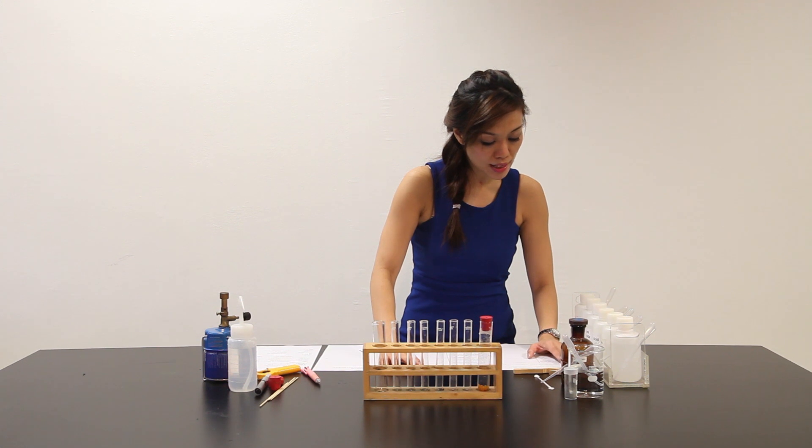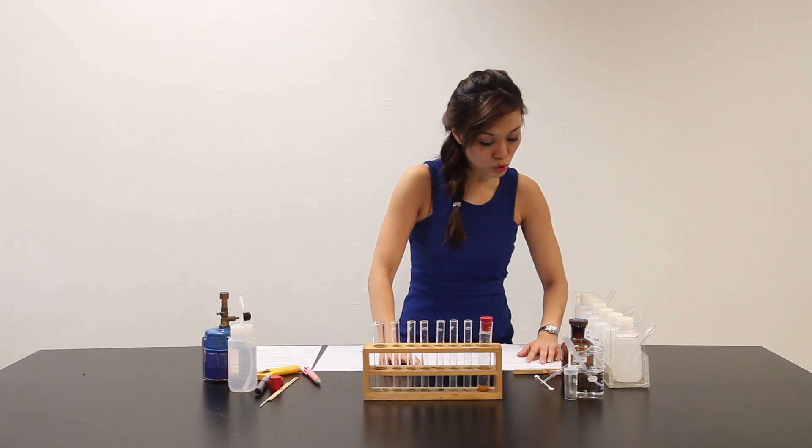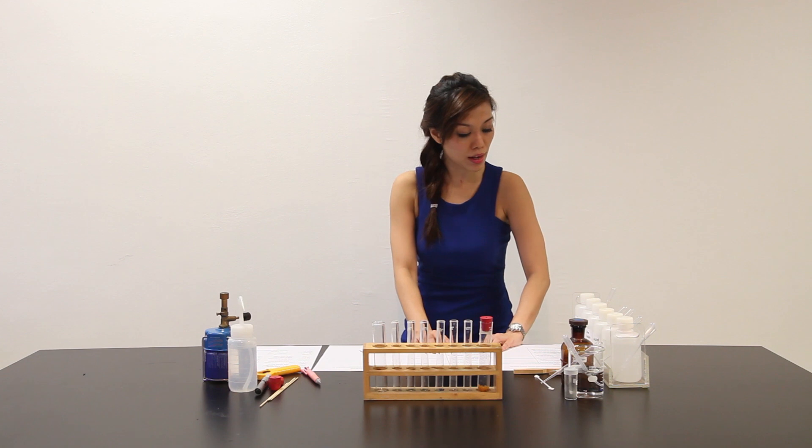Carry out a boiling experiment and test any gas evolved. Carefully record your observations. The volumes given below unless referring to drops of solution are approximate and should be estimated rather than measured.